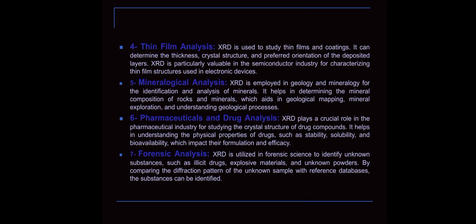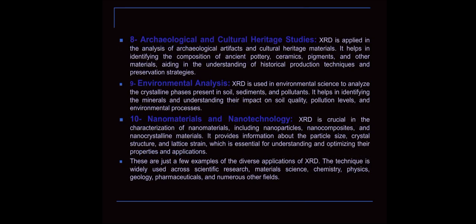It helps in understanding the physical properties of drugs, such as stability and solubility, which impact their formulation and efficacy. Forensic analysis: XRD is utilized in forensic science to identify unknown substances such as illicit drugs, explosive materials, and unknown powders.